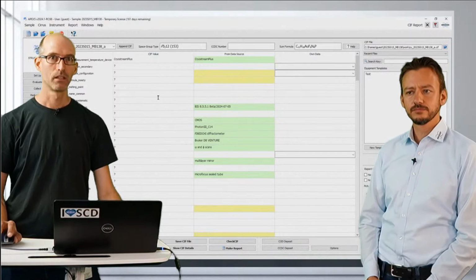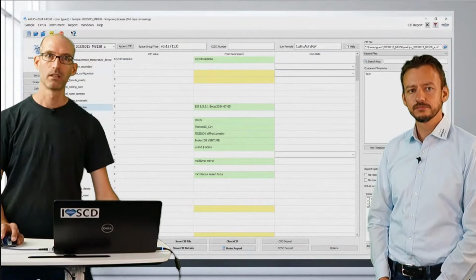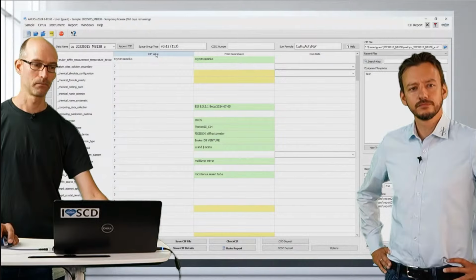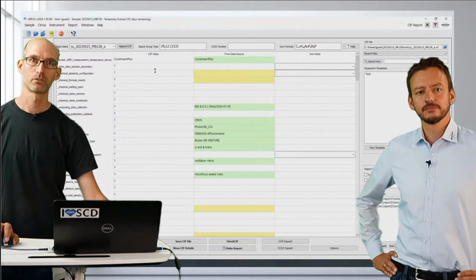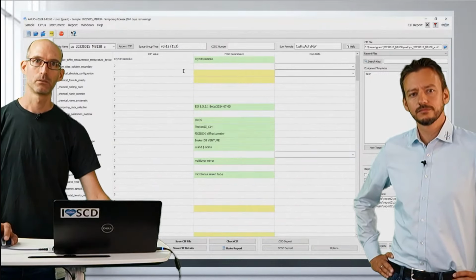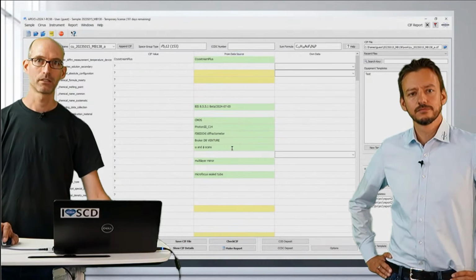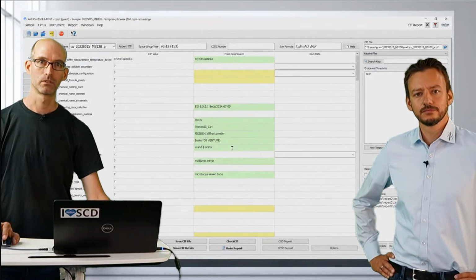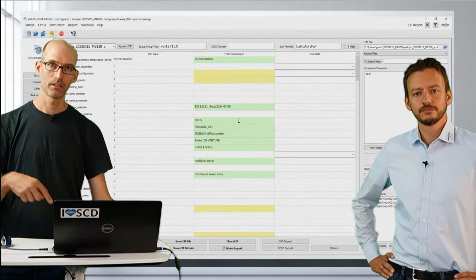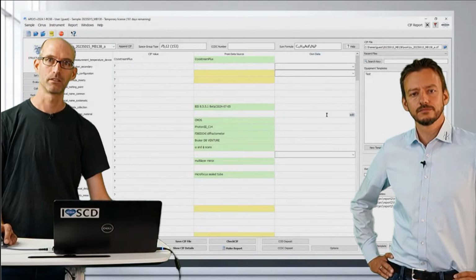There we have three main columns. And of course, the CIF keywords that are displayed here. We have three main columns. The CIF value column, which means that is the value that is in the CIF file. You have the from data source column. That is the column where data is input from inside Apex or other data sources. And so that will end up in the final written CIF file. And you have a column where you can edit the data by yourself.